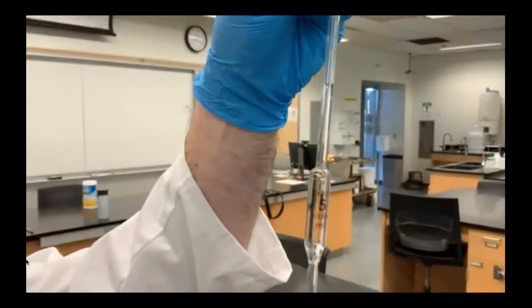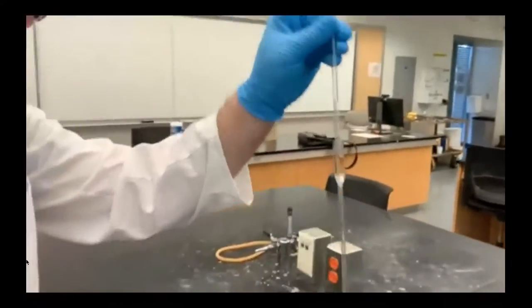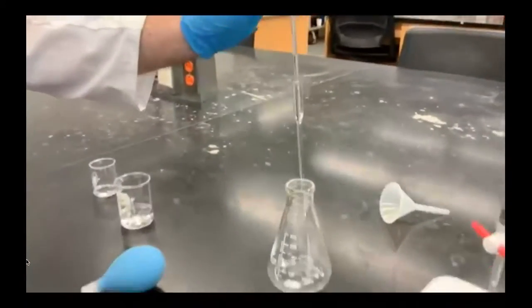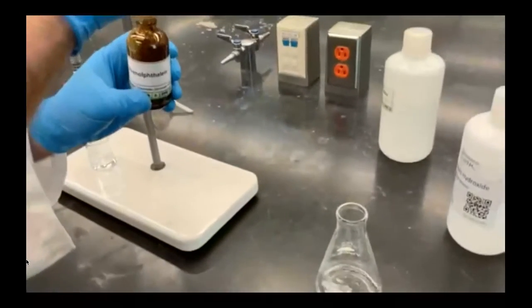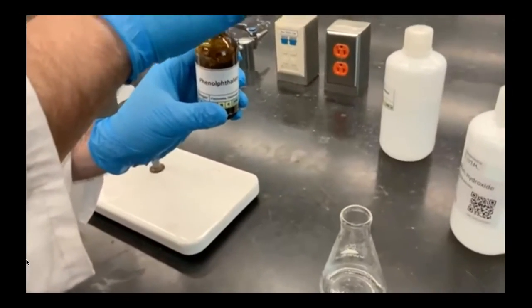We're going to draw up exactly five milliliters of vinegar and transfer it into our Erlenmeyer flask. We'll also add a little bit of water to that flask and five drops of phenolphthalein.